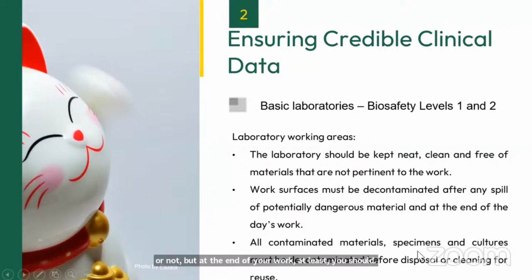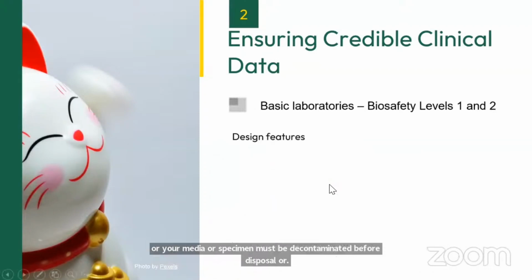All contaminated materials, specimens, and cultures must be decontaminated before disposal or cleaning for reuse. So any type of reusable material should be appropriately decontaminated before reuse, or your media or specimen must be decontaminated before disposal or before discarding those specimens.